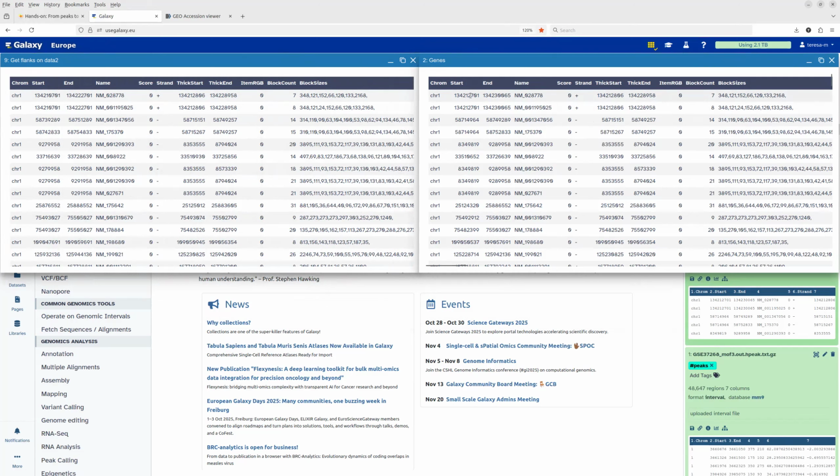Sorry, I'm very bad with numbers. Okay, so 134,212,701 was the original start position.